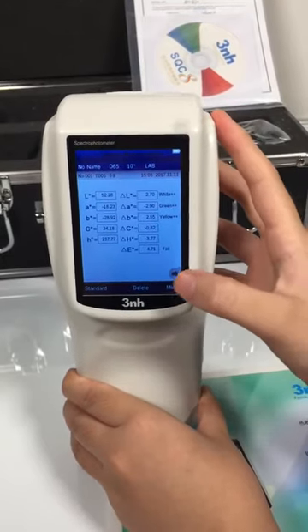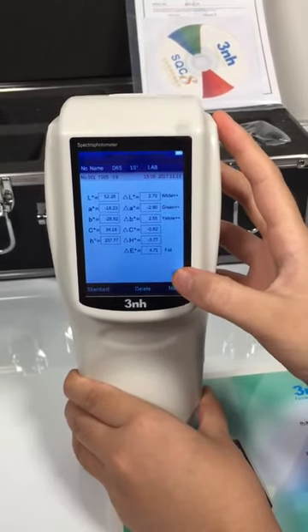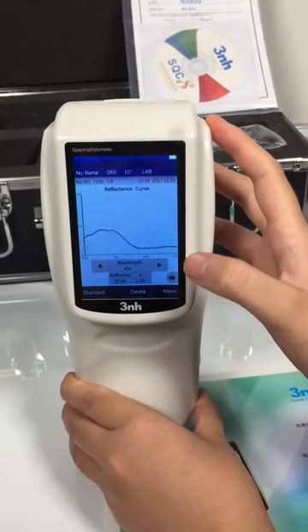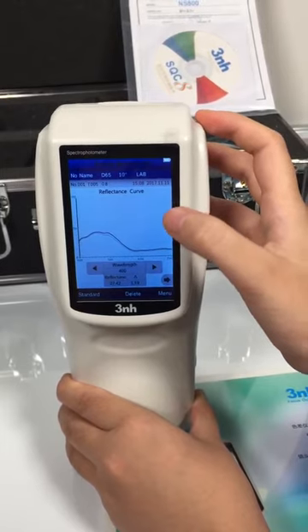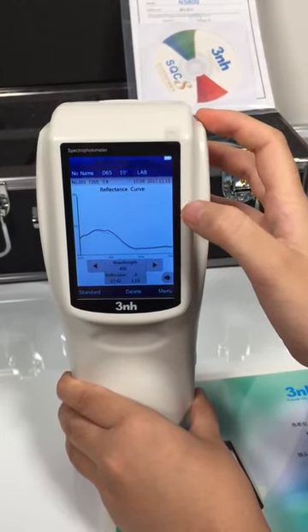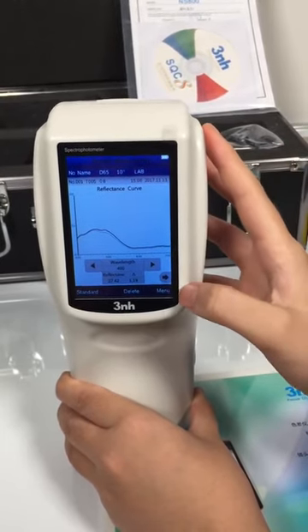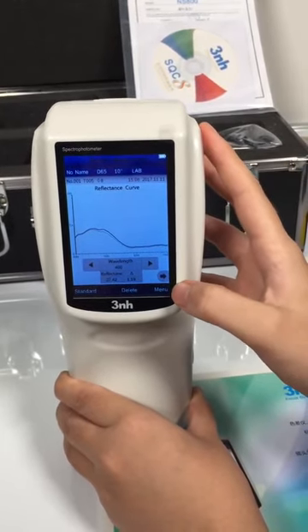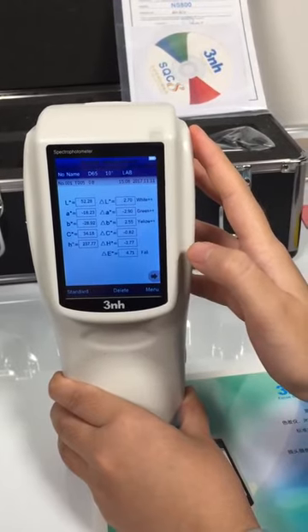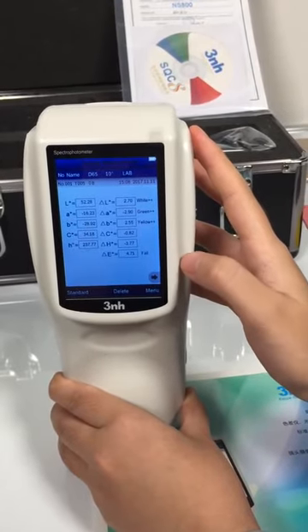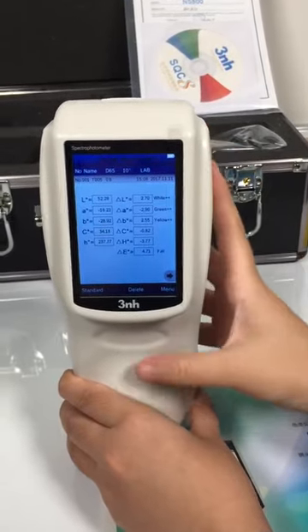Then we can see the reflectance curve. Then the measuring is finished.